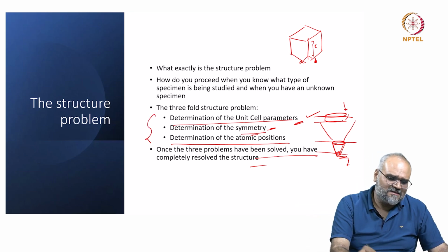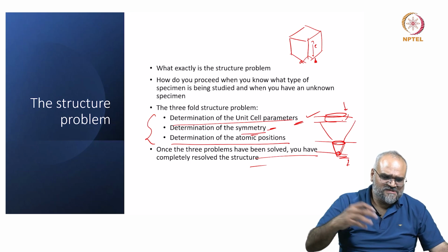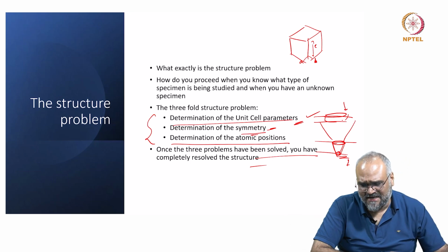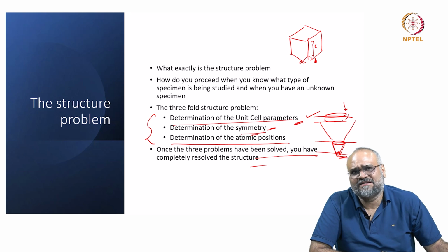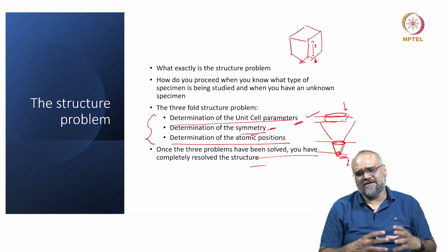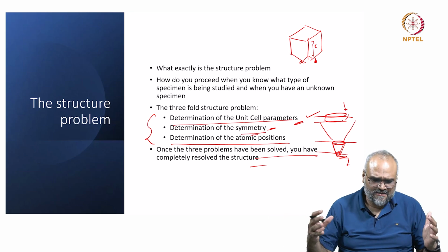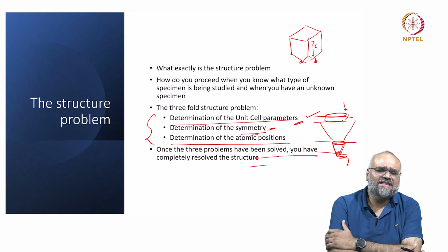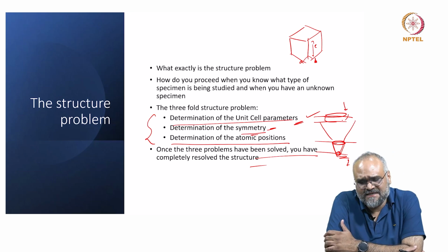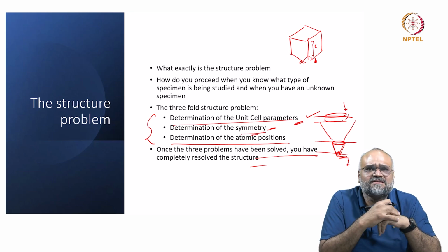You can get these three with complementary synchrotron diffraction or X-ray or neutron diffraction methodology as well, and that gives you a quantitative measure from a bulk specimen. And if I do the same thing with electron diffraction and solving my crystal structure with high resolution TEM or STEM techniques, I can also do it complementarily and I would have solved the crystal structure.